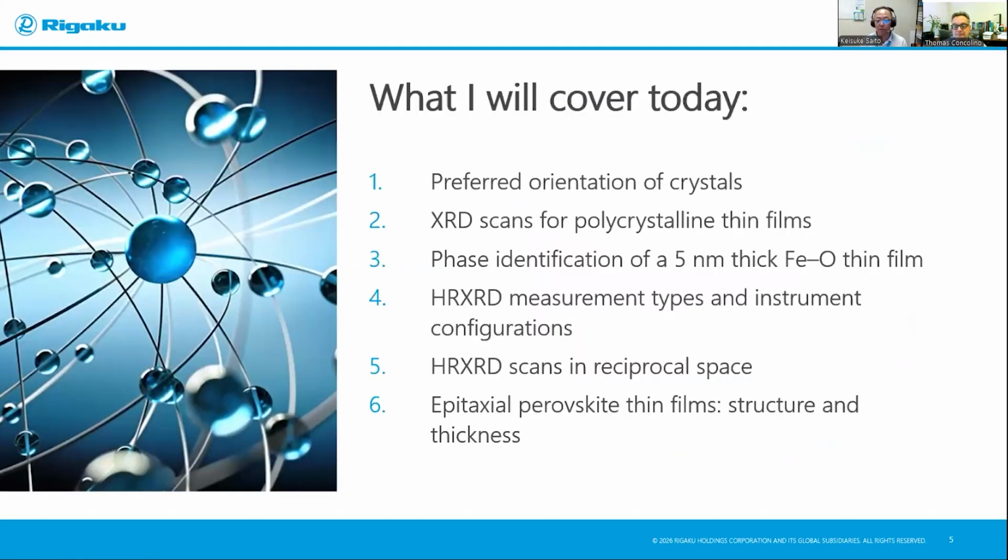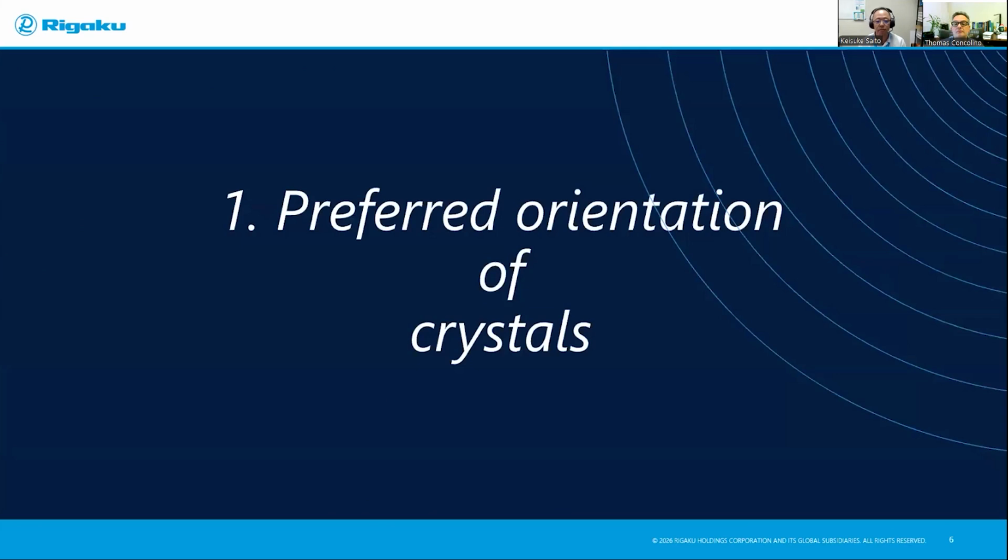All right, thank you, Tom. Welcome to this episode. Today I'm going to discuss thin film characterization by X-ray diffraction. First, I focus on polycrystalline thin film analysis in the first three topics. In the last three topics, I'm going to switch the talk over to high-resolution X-ray diffraction. So let's get started. Preferred orientation of crystals.